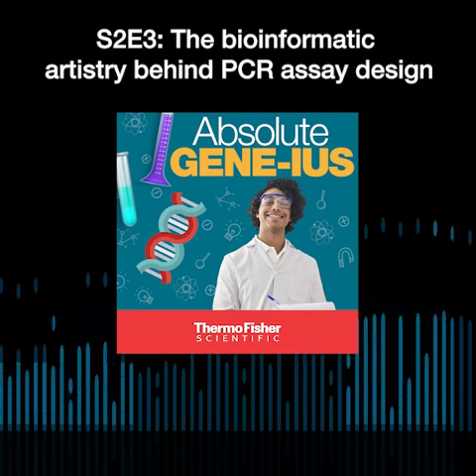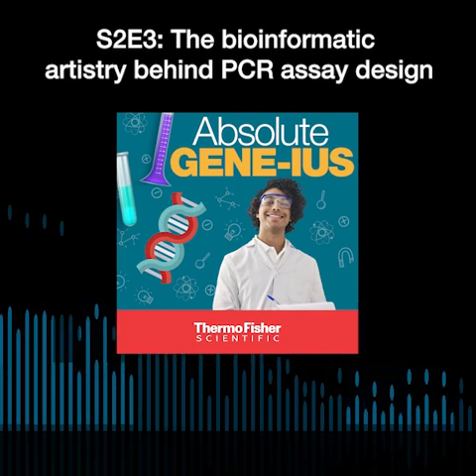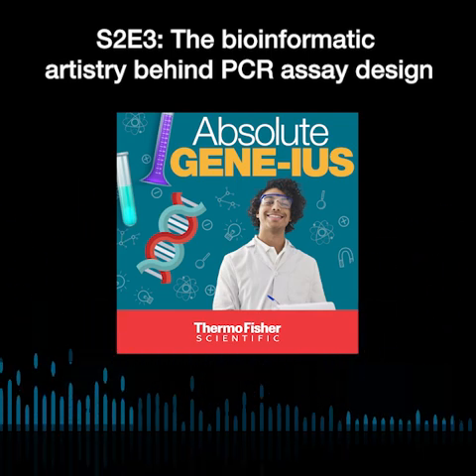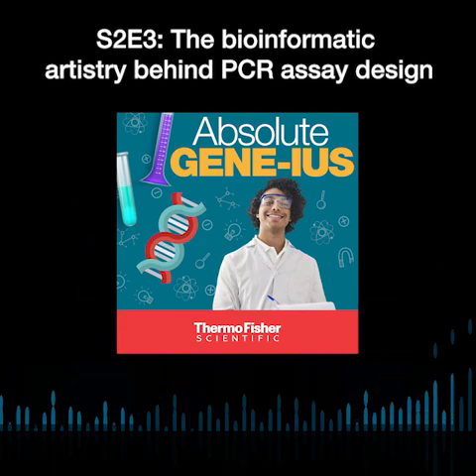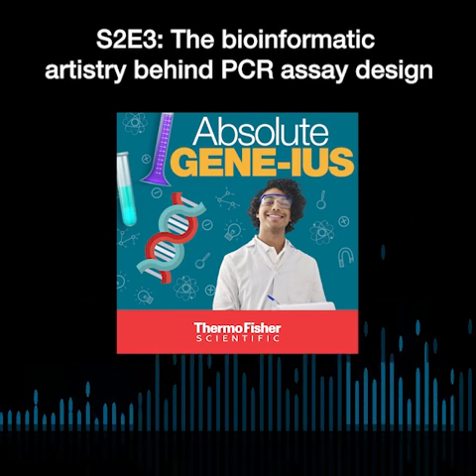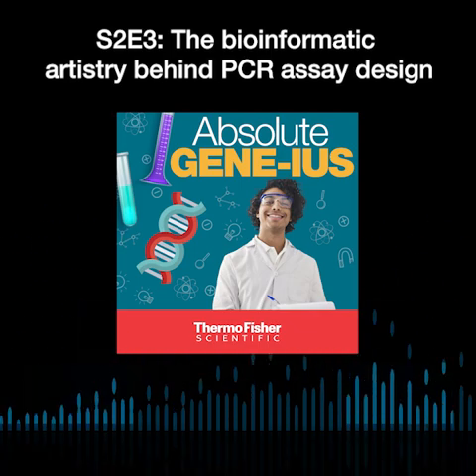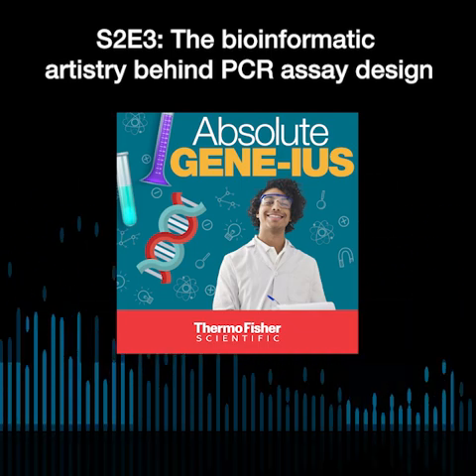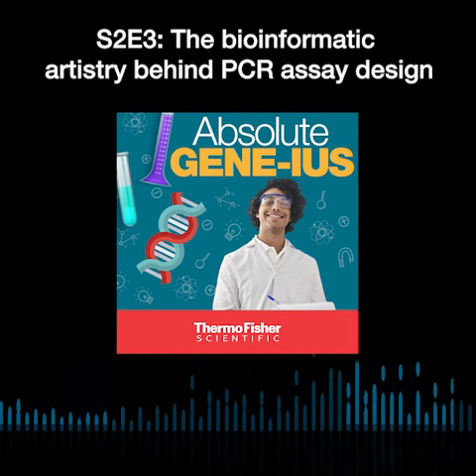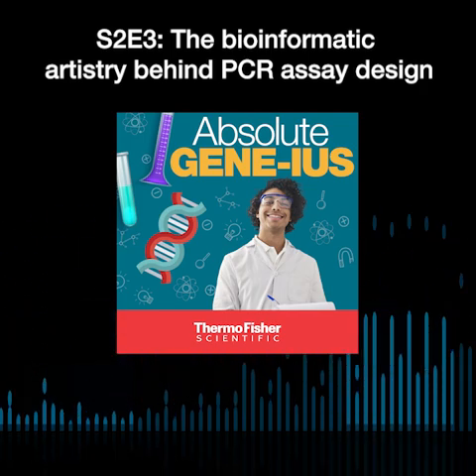After that, we also like to check for specificity in the genome in terms of targets. Sometimes, if your targets are close to one another, then we need to be more creative in our designs, because we do not want competition between our probes. There, some more advanced methodologies come into play.